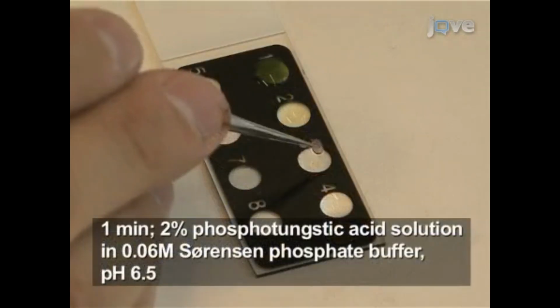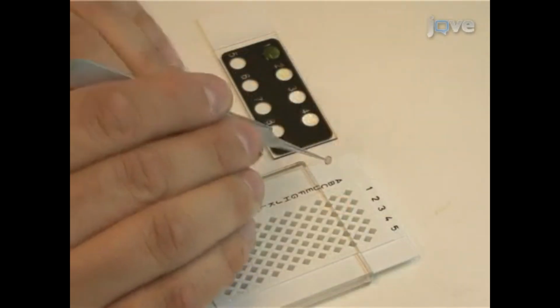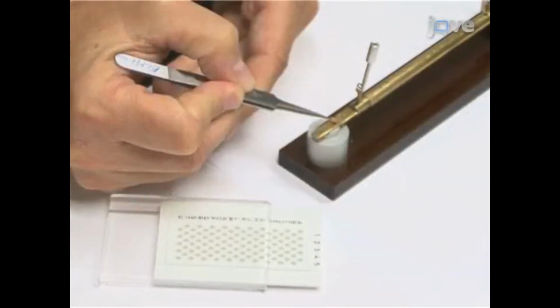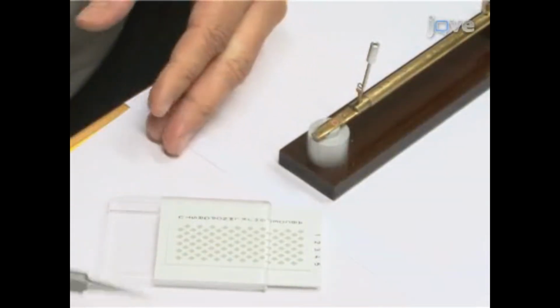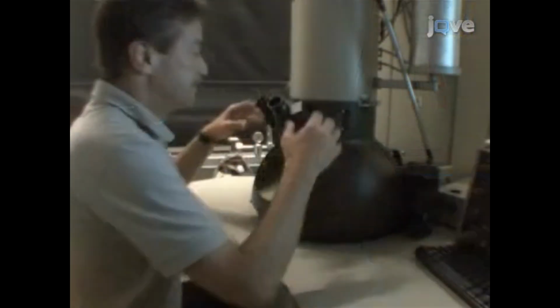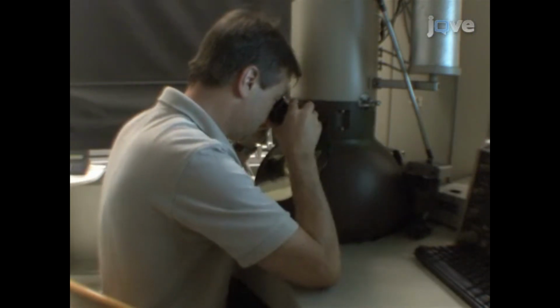Next, incubate the grid for 1 minute with a freshly prepared phosphotungstic acid solution. After 1 minute, remove the grid and allow it to air dry in a grid box. Load the negatively stained grid into the sample holder and examine it with a transmission electron microscope while polymerization is being carried out automatically by the microwave tissue processor.